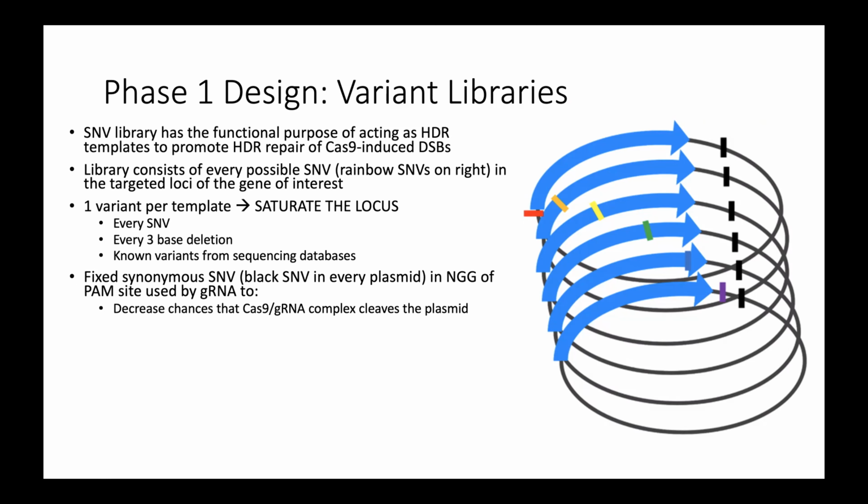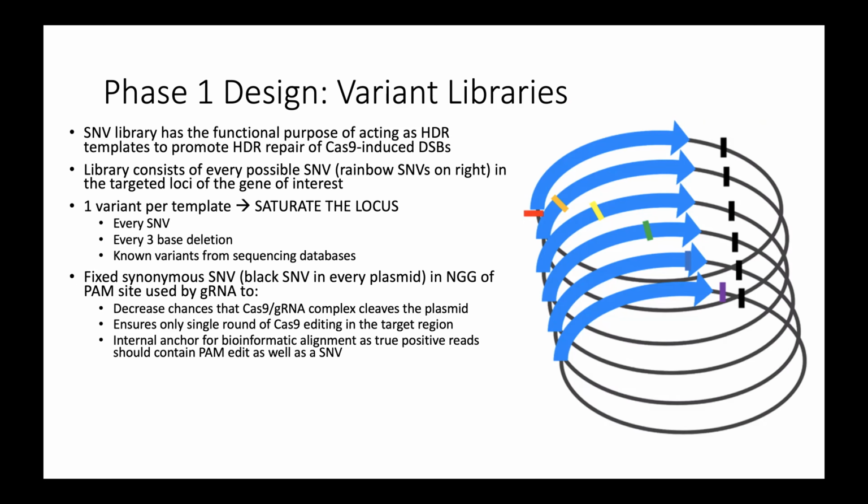So 1, it decreases the chance that the Cas9 guide RNA complex will cleave the actual plasmid itself. 2, it ensures only a single round of Cas9 editing in the target region. That's what we talked about on the last slide.